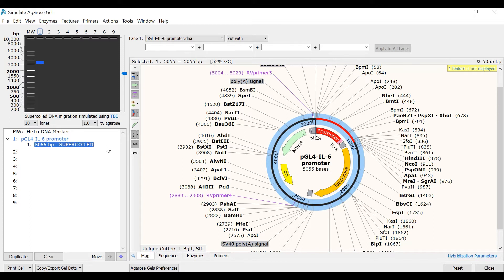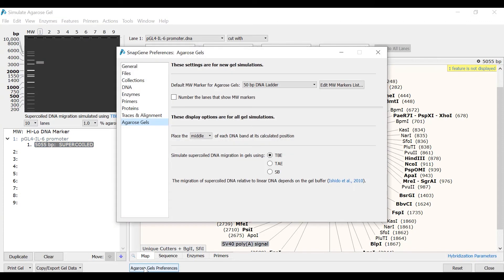Currently the buffer is TBE. However, if I select this, or select the Agarose Gel Preferences button at the bottom, I can change this to TAE or SB buffer. Notice how the band in lane 1 changes as I switch buffers. I will leave the buffer as TBE and return to the agarose gel by closing the window.